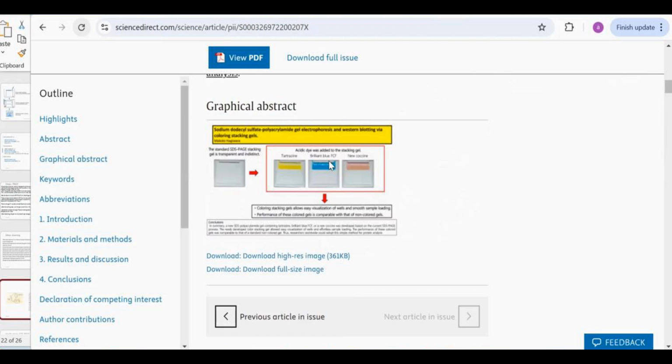So here you are going to have the benefit of glycine, you are going to have the benefit of chloride ion, as they are going to be running at different speeds, and the protein at another depending upon its own speed. So glycinate and chloride are going to act as two discs, and your sample is going to get sandwiched in that, or you can say concentrated in that, and it will settle in the stacking gel properly. So these things we have discussed in earlier lectures, and in the next lectures we will talk about the gradient gel and isoelectric focusing.